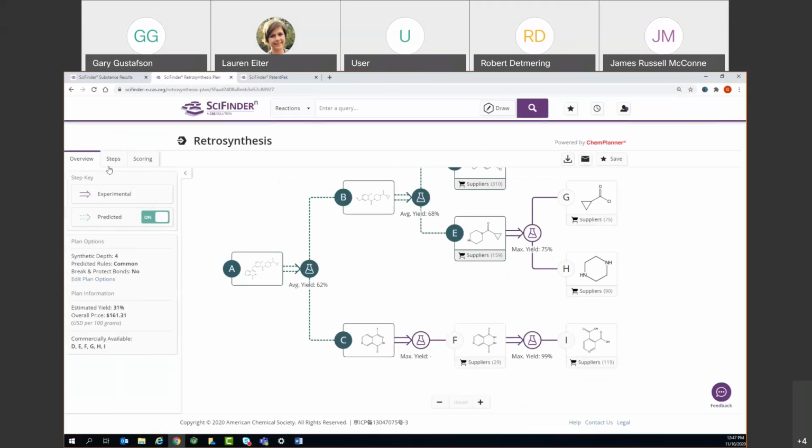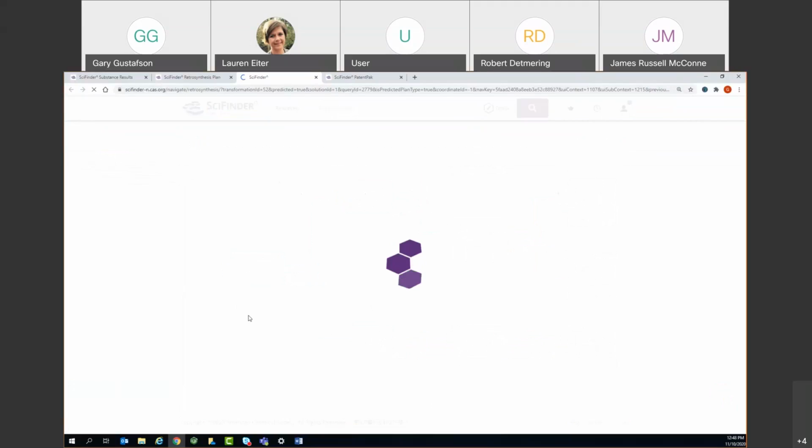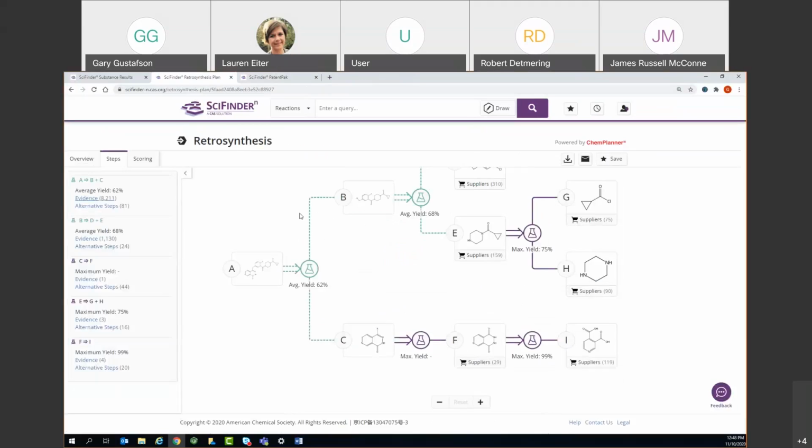But as I go in and look at the evidence associated with that, I'm trying to connect an aryl aldehyde here to a benzyl halide. So I look at my evidence here. I want to hopefully see something that's fairly close to that. So I think, yeah, we could go after this. It's almost the exact same situation, actually, it just doesn't have the nitrogen out here. This reaction is pretty well characterized, 92% yield, great. So I can feel moderately comfortable that would be a good approach.